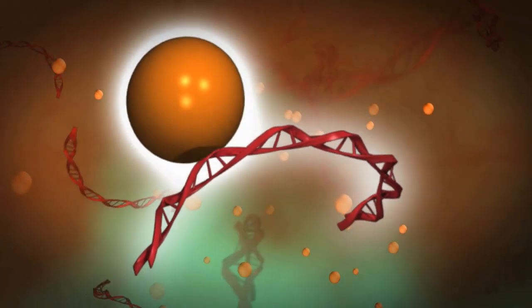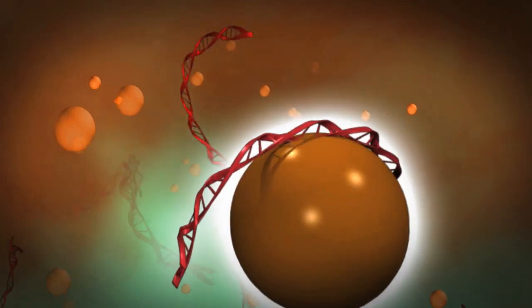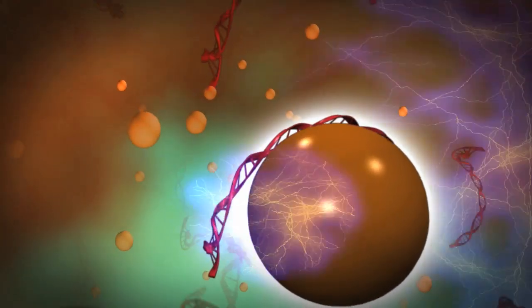Here, the DNA is purified using our proprietary DNA bead isolation technology, giving you confidence your sample has sufficient quality and quantity for optimal reaction conditions.